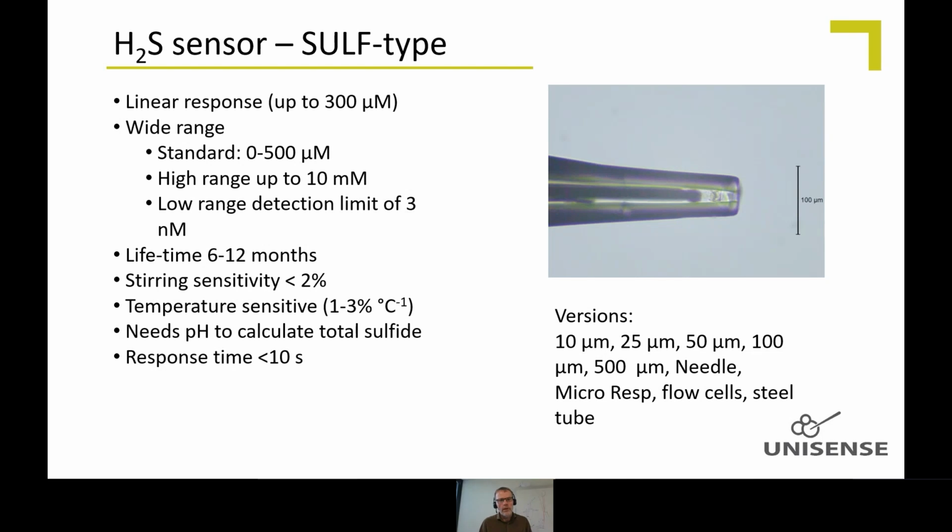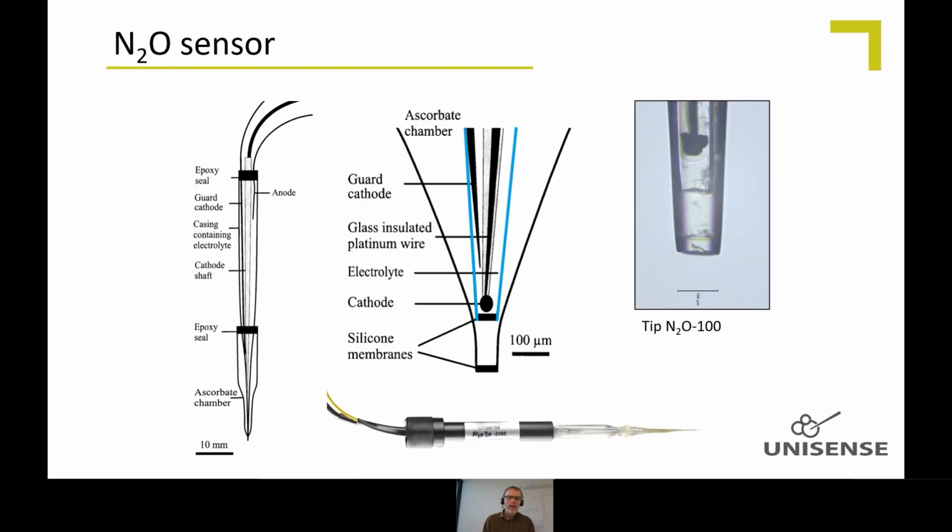It has a lifetime of about 6 to 12 months, stirring sensitivity like the others of about 2%. It's temperature sensitive at 1 to 3% per degree, just as the others. And you need pH to calculate the sulfide, and the response time is about 10 seconds.